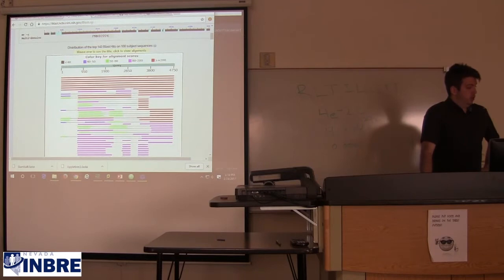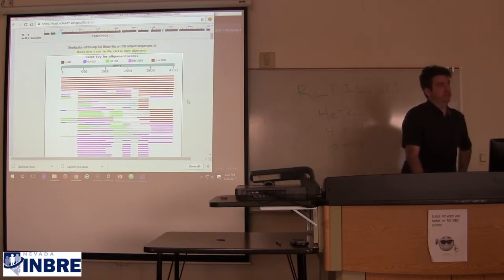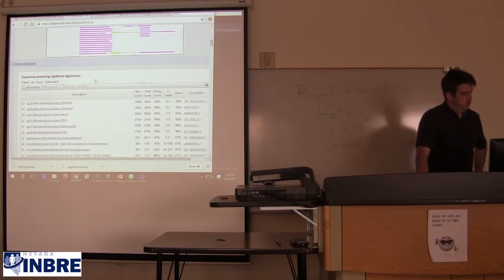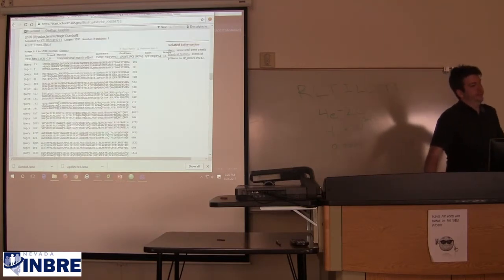So we get to our usual BLAST table or graphical summary, and we can see that we have some full length or nearly full length matches, which means I wasn't too mean when I made this. It looks like there's only a single gene in our query, and at least to the eyeball, almost all of it is encoded in that gene. Our top hit is even also from Gumball, so I chose something that's in NCBI. So hey, we get a little closer to our answer.